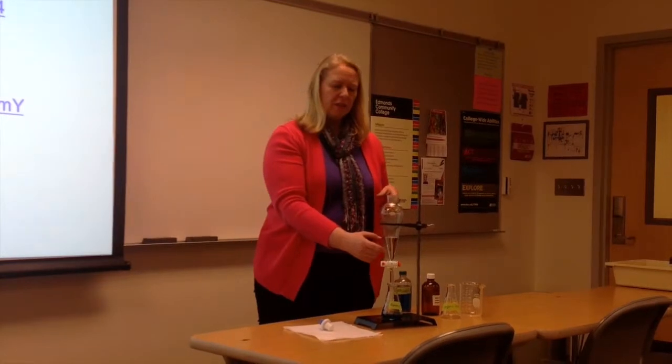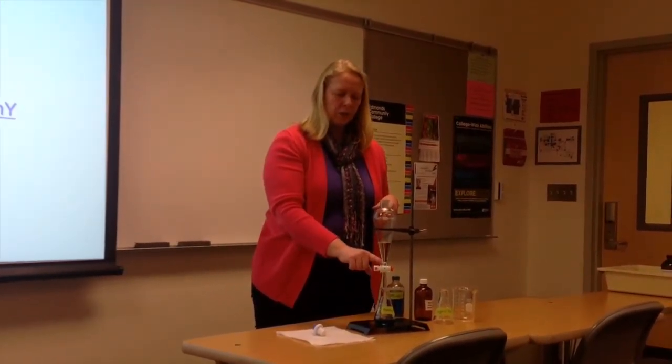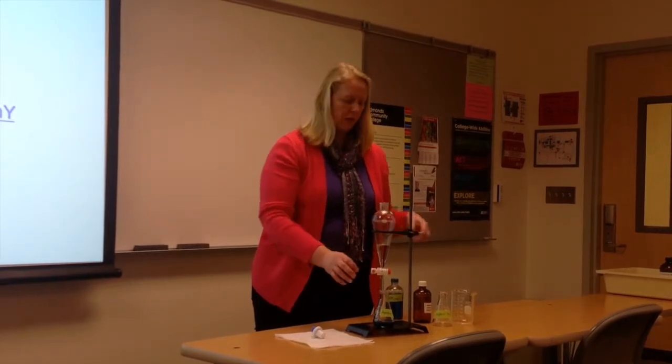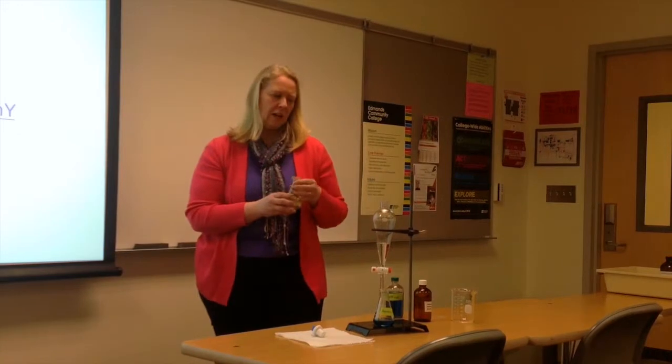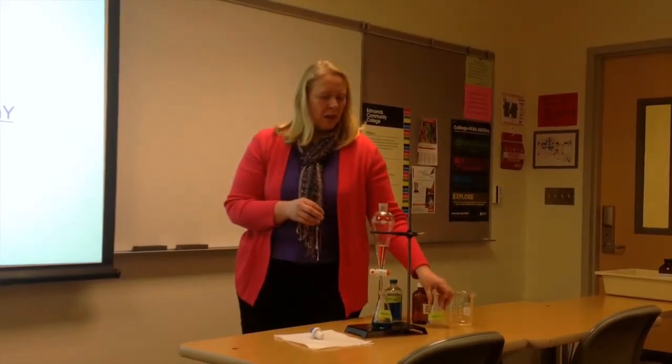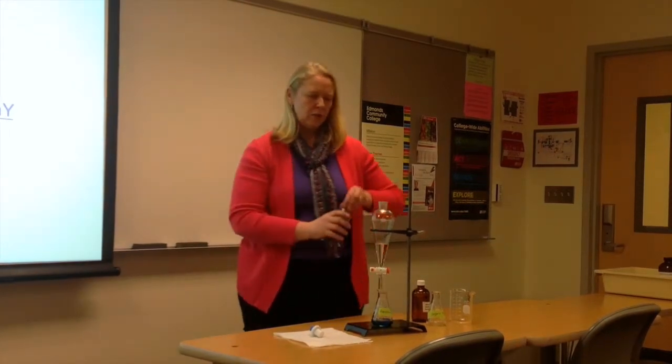If you have to recover the top layer, if that is the one you're interested in, then you would make sure that everything from the bottom layer gets transferred out, and then you would pour the top layer into your flask, and that's a cleaner transfer. One of the things you need to watch out for when you, and we can just do another quick one.